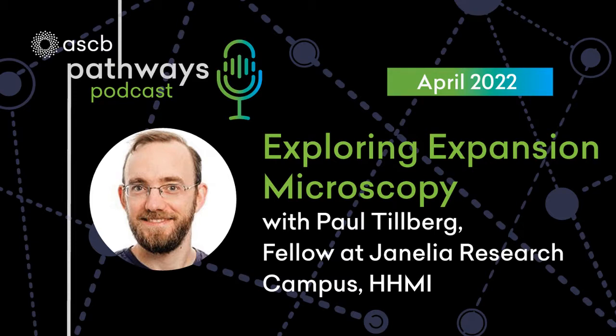Yeah, we were thinking a lot about these new emerging super resolution techniques like STORM and STED and SIM. And these were all powerful and intriguing techniques to get more resolution out of the microscope. And so that was very interesting. And you could look at the physics of how they worked. That was fun to think about. But at the back of my mind, I always had this idea that maybe we could do it the other way. Instead of making the microscope more powerful, could we make the specimen bigger and then just use whatever existing microscope you have?